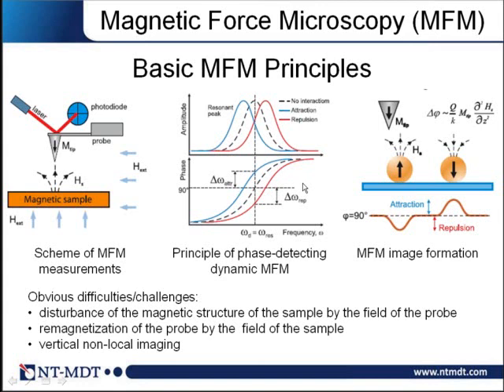Well, the question is rather interesting. What will be the resolution under a magnetic field? Well, in principle, the application of the magnetic field does not change your resolution, because, excuse me, resolution is mainly determined by the properties of the probe, for example, its curvature and the value of the magnetic moment on the probe. In this sense, I would say that it's not changing.